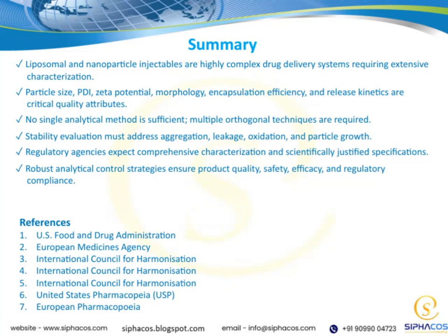We've covered a lot about liposomal and nanoparticle injectables, highly complex drug delivery systems that demand thorough characterization. Key quality attributes include particle size, distribution, surface charge, shape, how well the drug is encapsulated, and how it's released. No single test tells the whole story, so we rely on multiple complementary methods. Stability is crucial, too, watching for aggregation, leakage, oxidation, and growth. Regulatory bodies expect detailed, science-backed specifications. Strong analytical strategies keep these products safe, effective, and compliant.